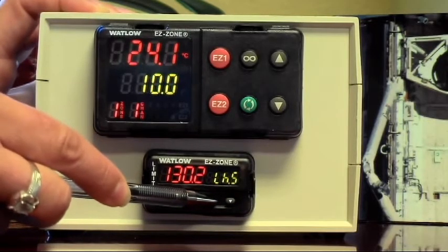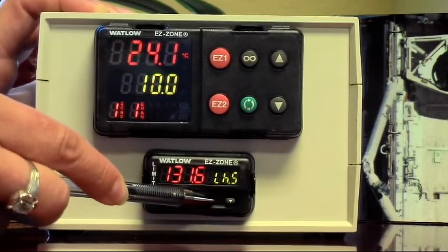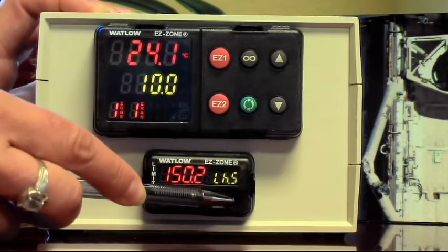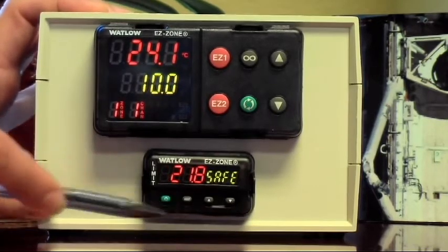Down arrow goes down, up arrow goes up. Use the down arrow to navigate to your desired temperature. Once you reach 150 degrees, press Reset — and that's all you have to do.